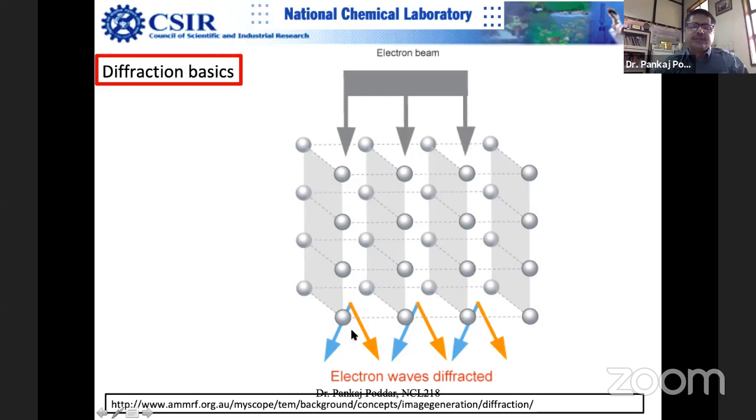We show it by this arrow, but if you rotate this arrow along the optic axis, it becomes a cone, like a birthday cap. So it's always like that, right? If you take another family of planes, for example, diffracting at a higher angle, there will be another concentric cone. So there are several cones actually.